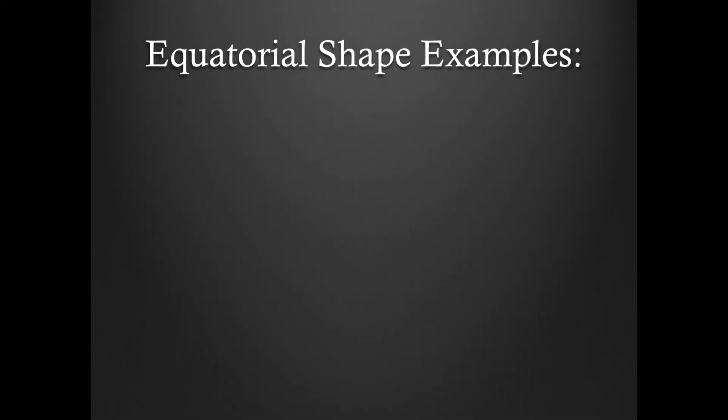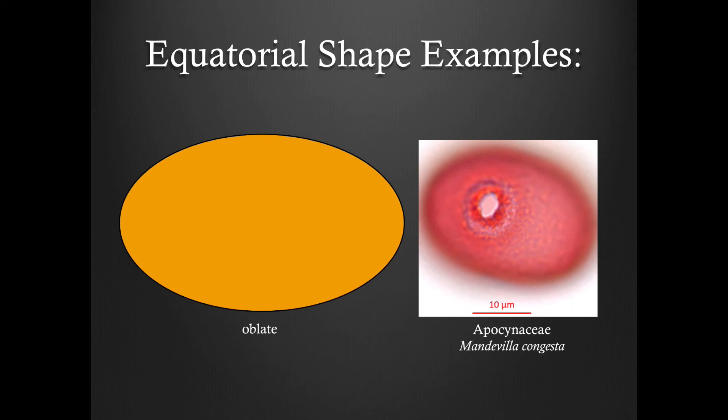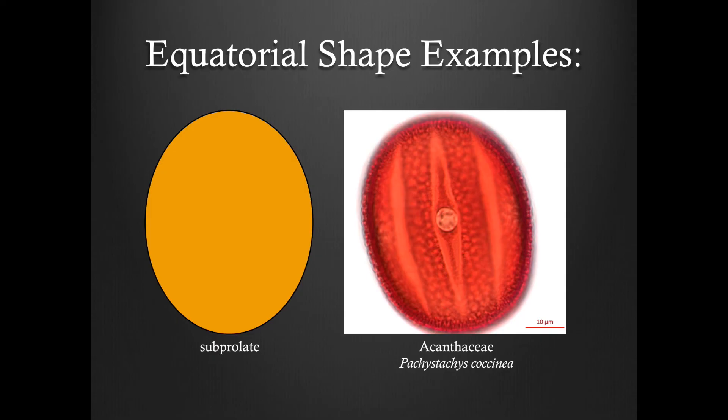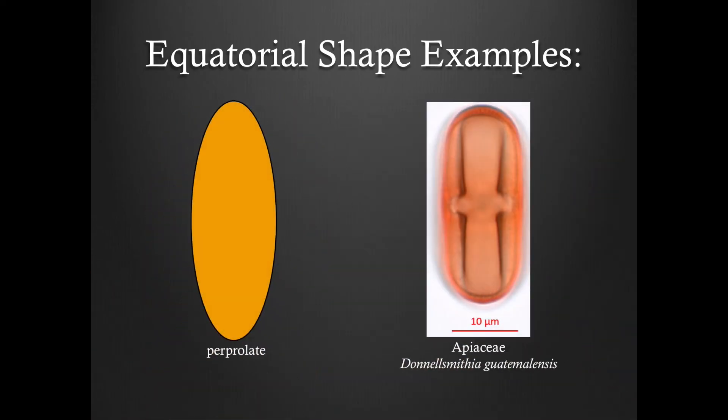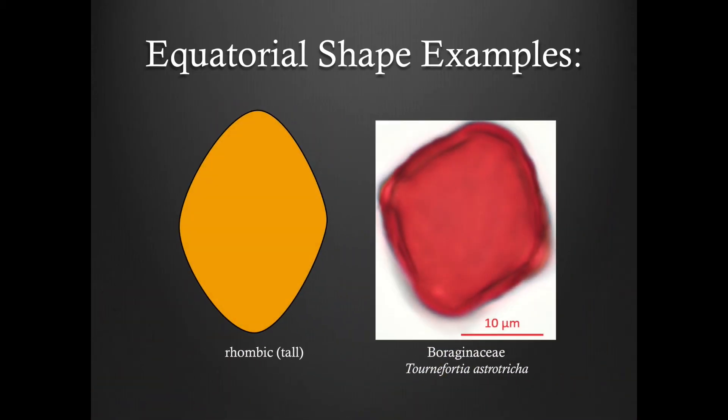Now here are some examples. Here is an oblate grain. Here we have a subprolate grain. Here is a perprolate grain. And here we have a rhombic tall grain.